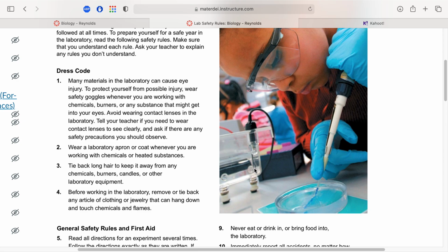And there's no eating and really no drinking when you're at the lab table. Keep your book bag off to the side. We're going to have quite a bit of glassware on the table. So sometimes it gets pretty busy and you're aware of your own stuff, but then your neighbor right over here might have some stuff and you can knock it over. If things break accidentally, that's okay, but try to be neat and it avoids the accidents. And we'll go over some of the glassware here in a bit.